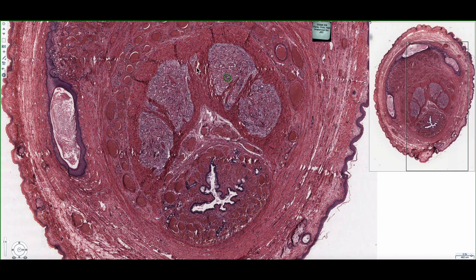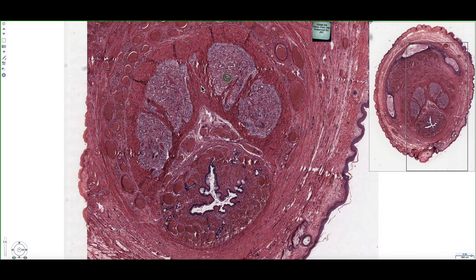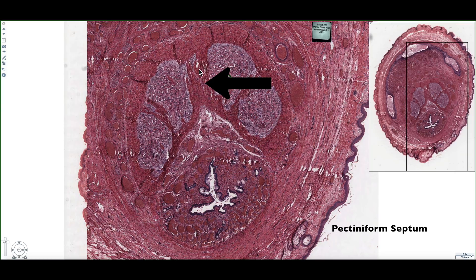The region between the two corpus cavernosa that's filled with this dense connective tissue has a specific name — it's called the pectiniform septum. In some cases this area may be incomplete, so you may actually see the two masses of the corpus cavernosa meeting up with one another.